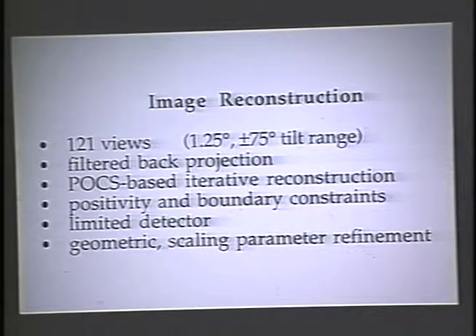As a consequence, since we can't do that, there are direct consequences from having both not finely sampled the data enough as well as incompletely sampled it, which give rise to aberrations in the final reconstruction. There are now very powerful mathematical approaches that one can use to remove those aberrations in a very regular way. There's a series of reconstruction methods that Craig Abbey in the lab has been developing, based on a mathematical concept called projection onto convex sets.